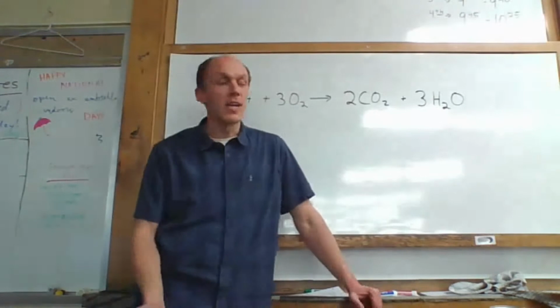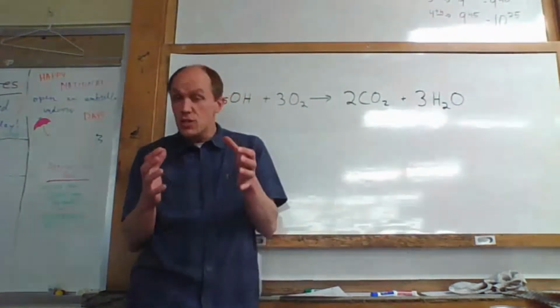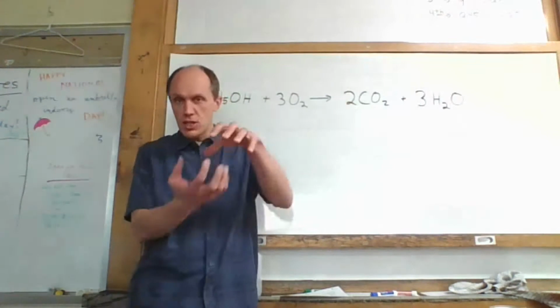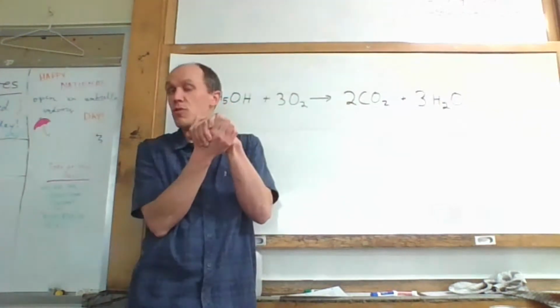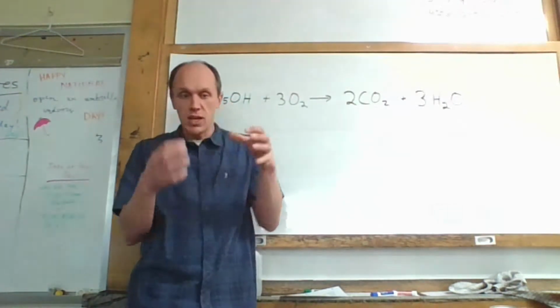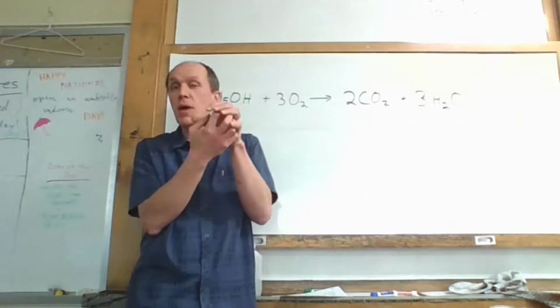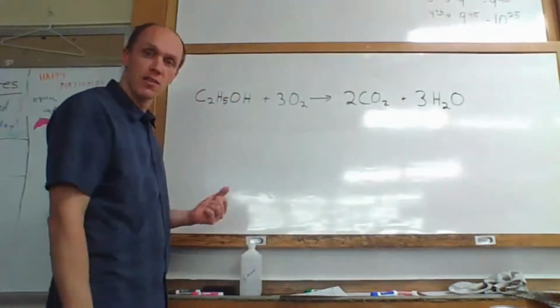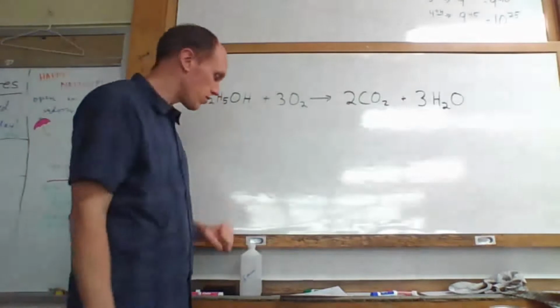We've been talking lately about calorimeters, how we can collect the energy from a chemical reaction, the heat that is given off by the chemical reaction, get it absorbed by water. And then we can calculate how much energy goes into the water, and based on that, we can find the enthalpy change for a chemical reaction, like this little guy up here. So there's two parts to it.